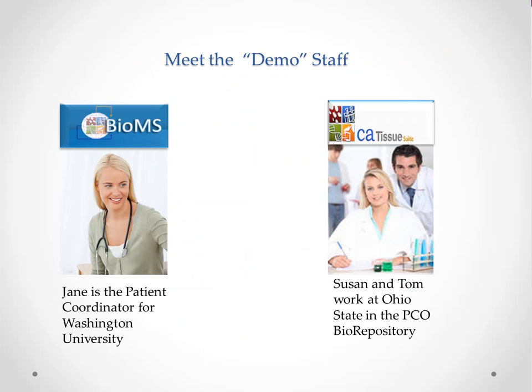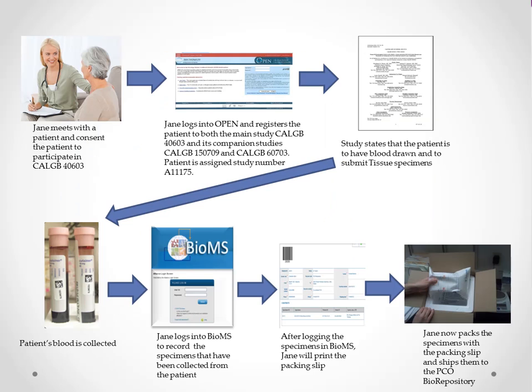Now let's meet the staff for today's demonstration. Jane is the patient coordinator at Washington University, and she will be using the BioMS application. Susan and Tom work at Ohio State in the PCO biorepository, and they will be using the caTissue application. Now let's start from the beginning.